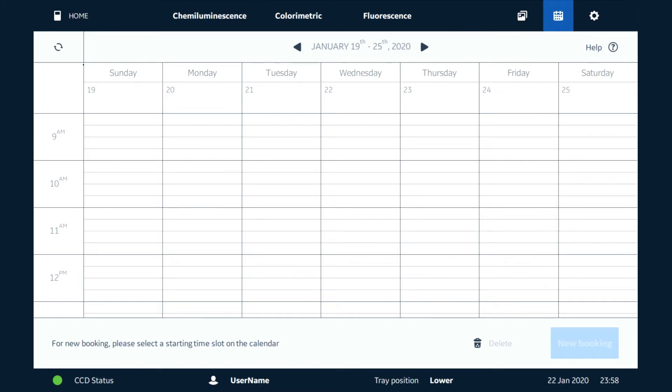Once we open up the application we can go to the screen, decide which time and date we want to use. So let's say we're going to be Friday the 24th of January at 10 a.m.